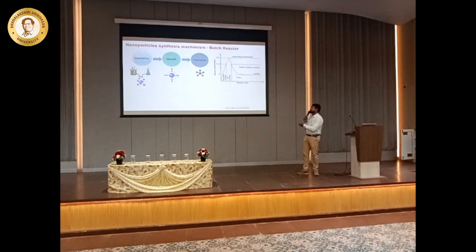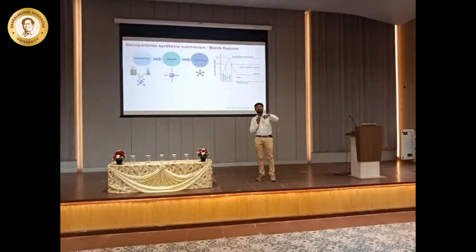So if I start adding my gold precursors, at a certain concentration, it forms a nucleation. Consider an analogy: you take a glass of water and you start adding a pinch of salt. What will happen? It will solubilize, right? If I'm adding one more spoon, or say, in a mathematical expression, I'm adding 1 gram of salt in 1 liter of water.